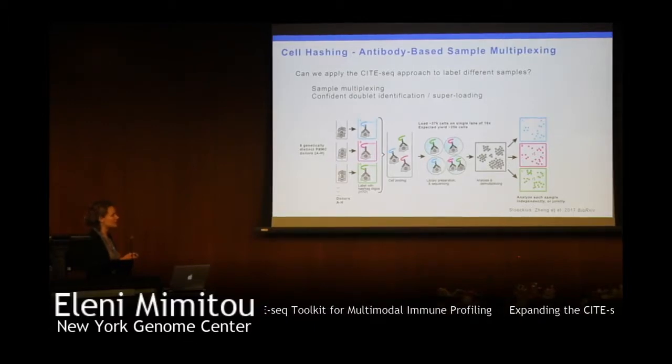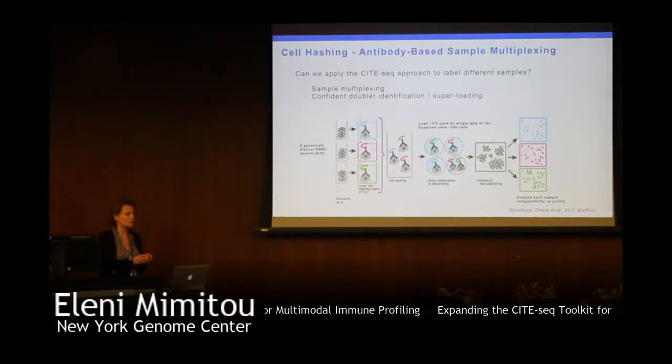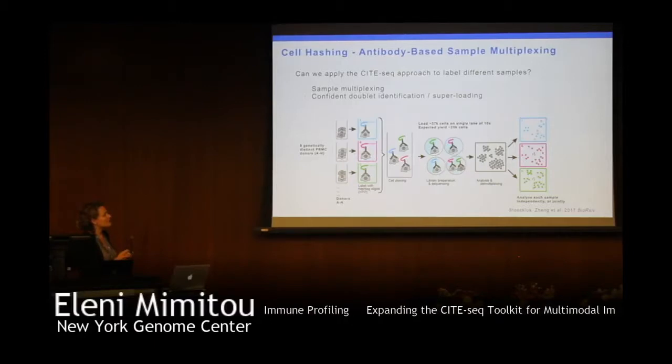We also use a cocktail of B2M, beta-2 microglobulin, and ATP1A1, the cell surface ATPase. The samples, being stained and washed, are pooled into the same run, and we can demultiplex the samples later using the barcode and trace each cell back to the sample it originated from.